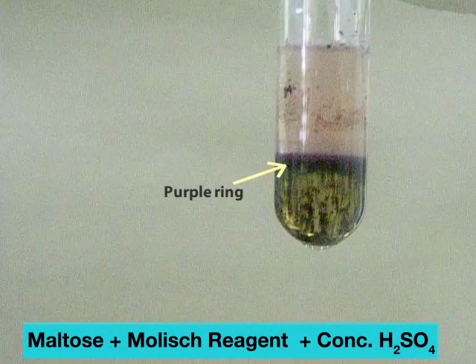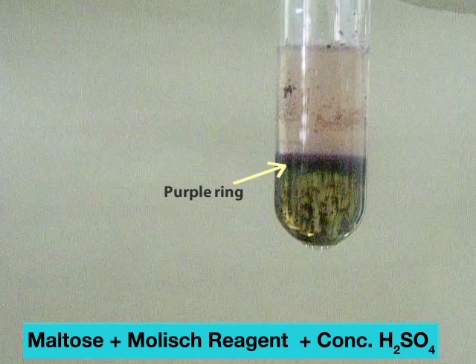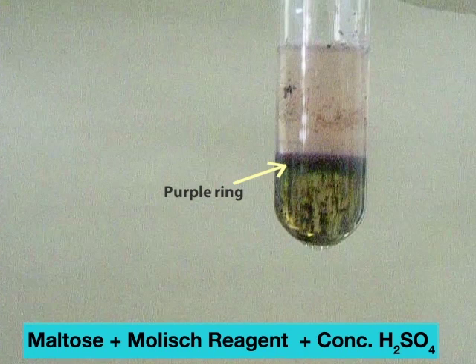A purple coloration, seen as a ring at the interface between the acid and the maltose and Molisch reagent, indicates the presence of a carbohydrate.